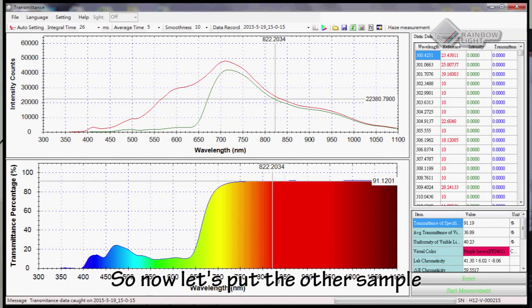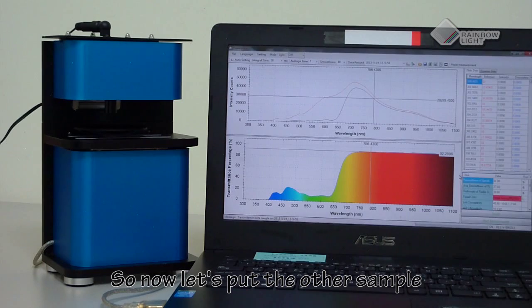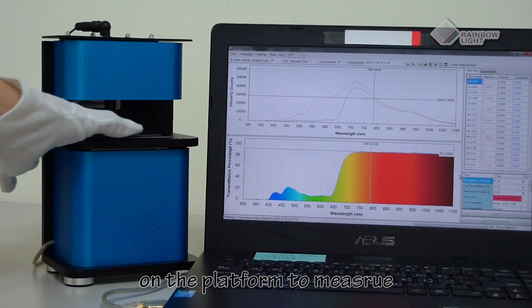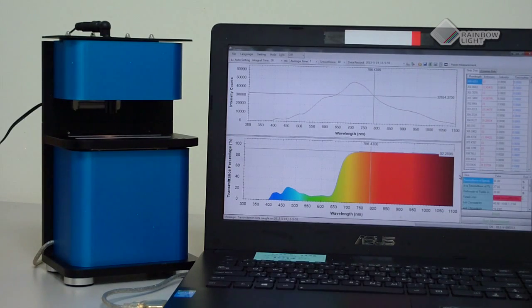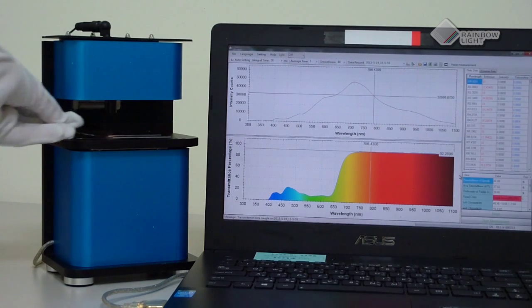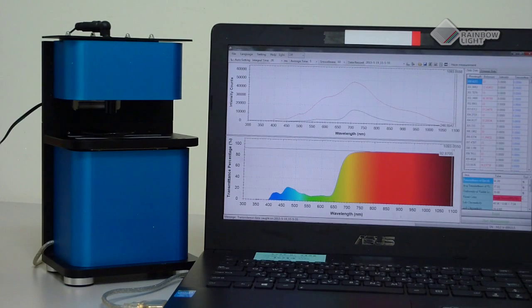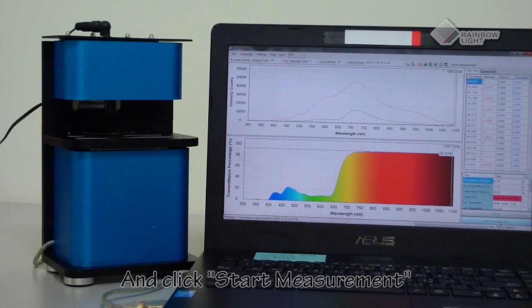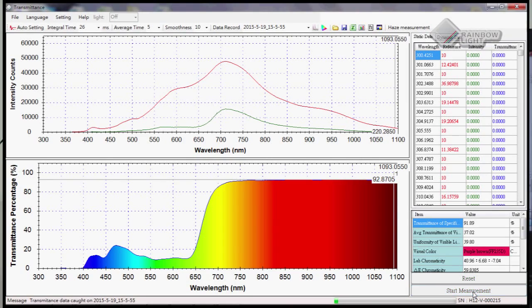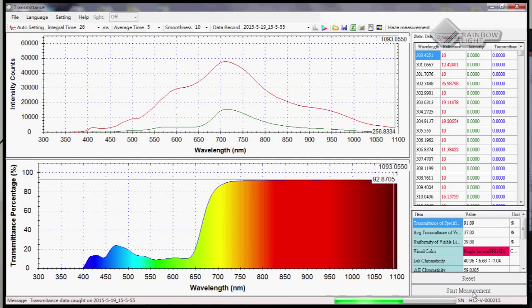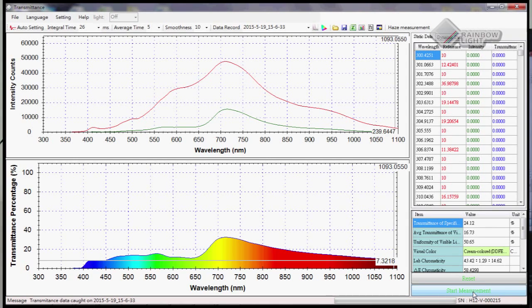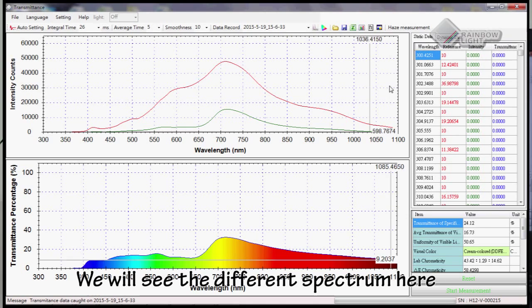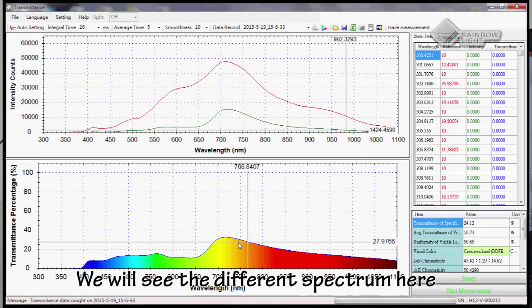Now let's put the other sample on the platform to measure. Click start measurement. We will see a different spectrum here.